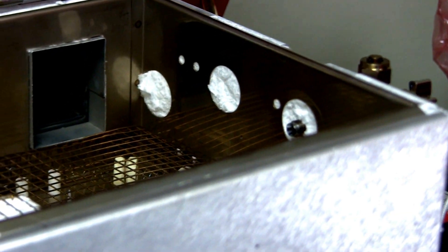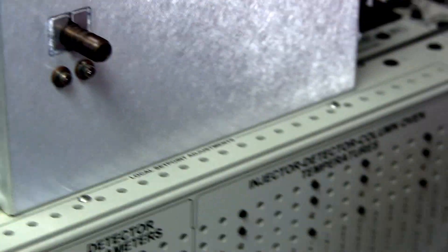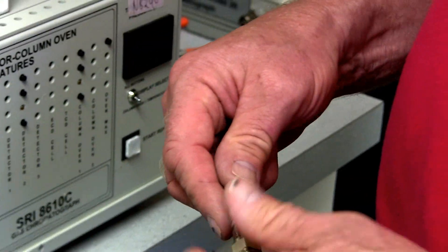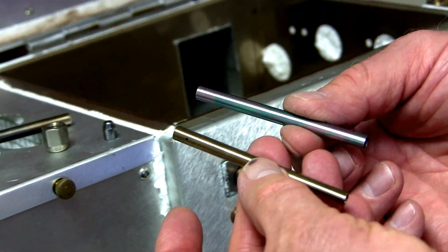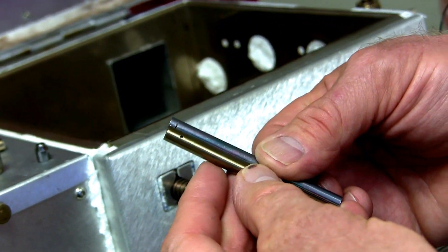Now to clean the injector liner, this is what the injector liner looks like. We actually have two different types of injector liners, two different inside diameters. One looks like this, the other looks like that. They're both exactly the same length.